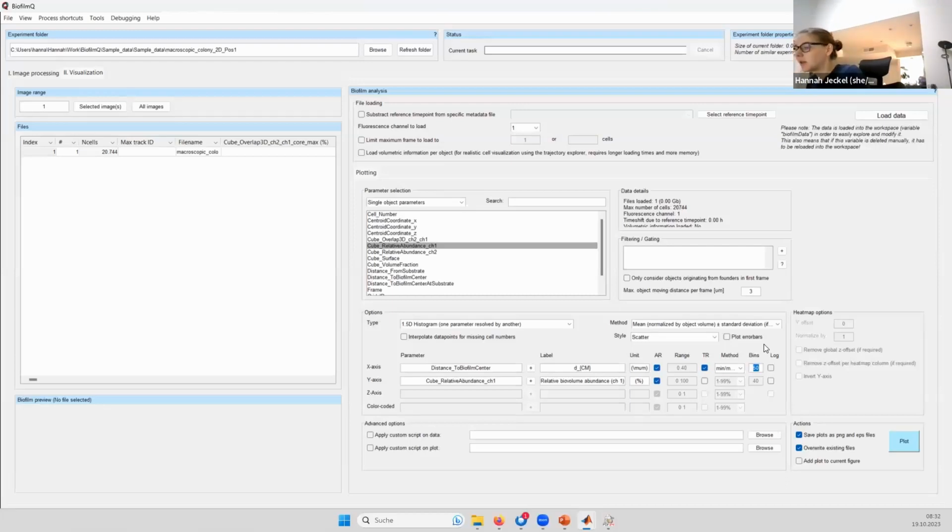What is incredibly important to realize with the bins is that if you have a spatial measure and you have a cube size, then choosing a bin size that results in bins smaller than your cube size never makes sense, because it's basically only going to have one layer of cubes assigned to it. So with this number of bins, if you go for something like maybe 15 or even 10, you're in a good range. Often you also don't need a lot more.